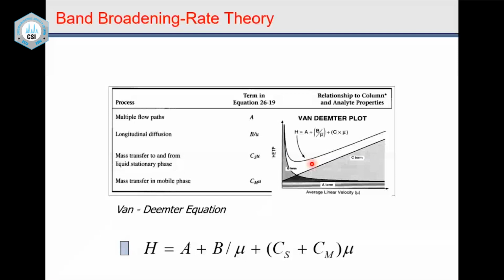So the components will get eluted fast. So I will be able to use this curve, which is called Van Deemter's plot, for calculating the linear velocity and using that for the chromatographic run which I want to work with.